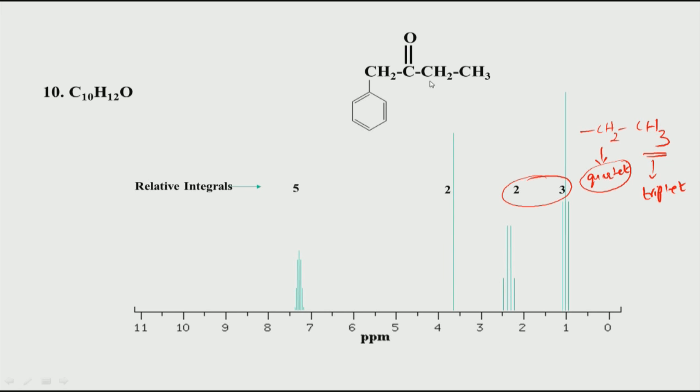On this side, this is what we saw, there is a CH2 and a CH3, and that is standard. Remember I said that whenever you see a triplet methyl and a quartet somewhere around 2 ppm, automatically it means this group is present, but this group is not attached to oxygen. That means it has to be attached to something else, but if it is attached to a carbon containing a hydrogen, then you will not expect a quartet, because that hydrogen would add to this. So, 3 plus 1 plus 1, you would expect a quintet for this.